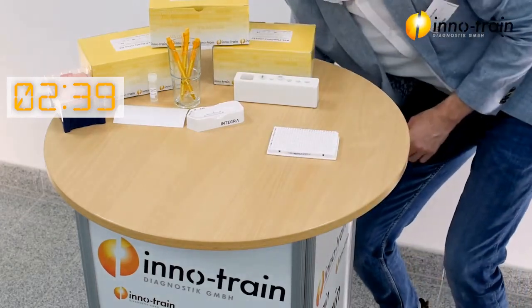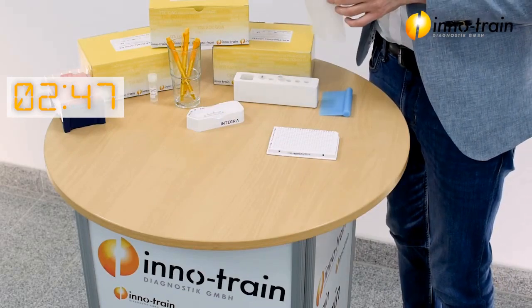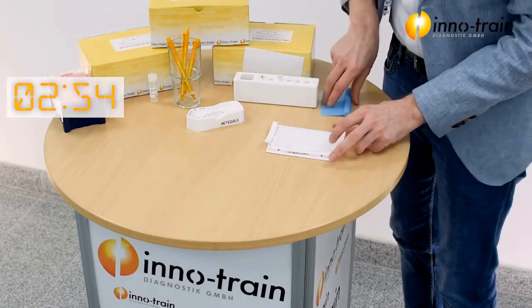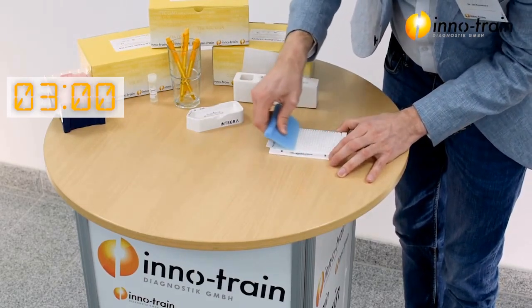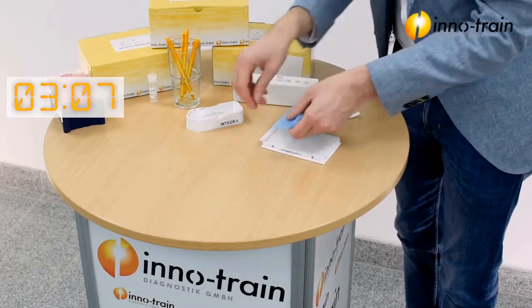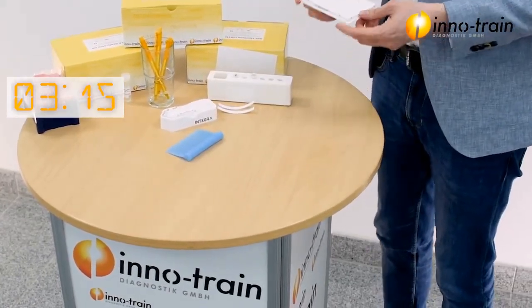And we're almost done. Last but not least, we have to seal the plate with the optical foil. For this you can use our Flu app and tightly seal the foil to your 384 PCR plate. That's it. Now we just need to centrifuge it for 2 minutes.